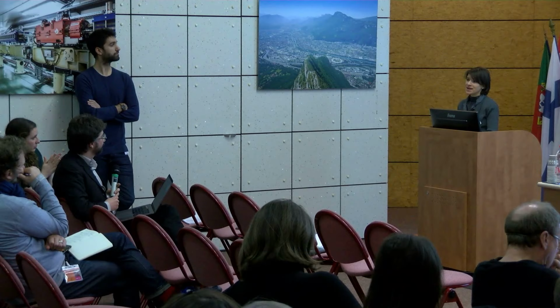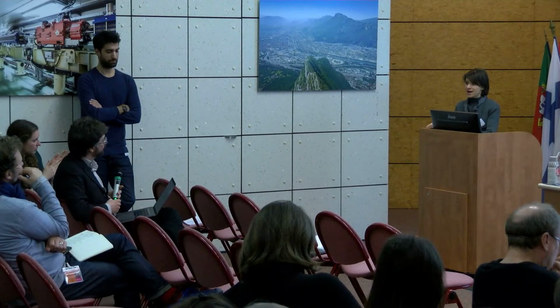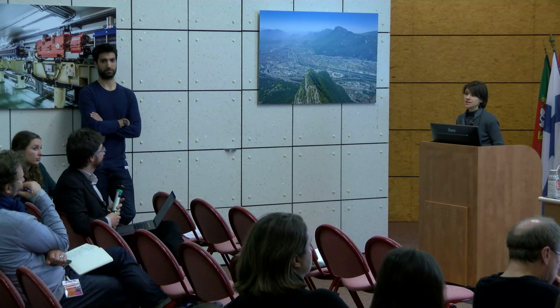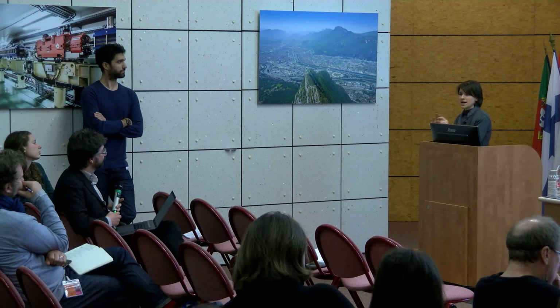Because even if it's published and you have these values, when you work at different beam lines, you know the fluxes, but sometimes it also depends on whether you work in environmental condition or in vacuum condition. This is a case that we observed by doing experiments at different beam lines. The result that I showed you before was related to an experiment that we did with an unfocused beam at ID26 in an environmental condition.